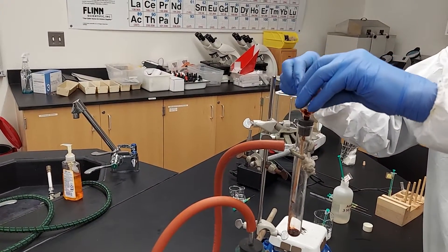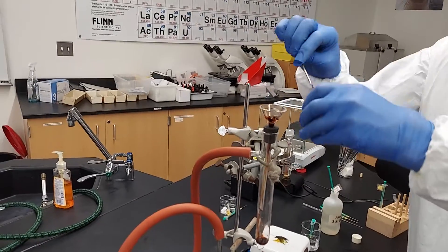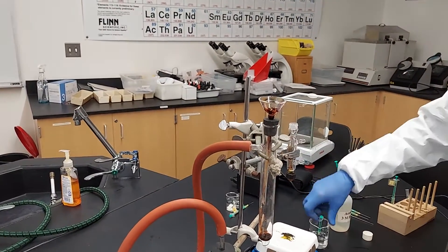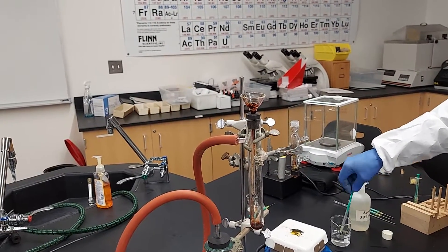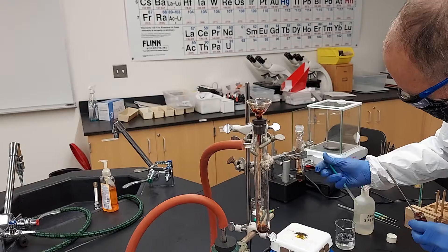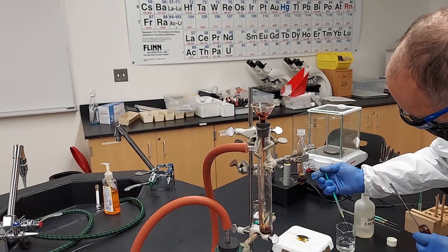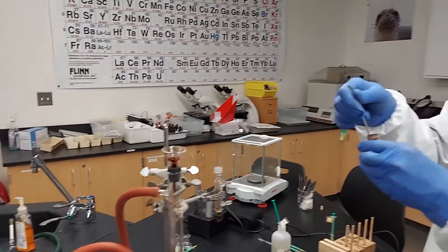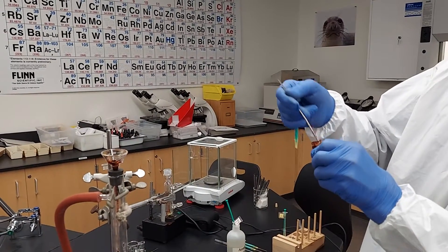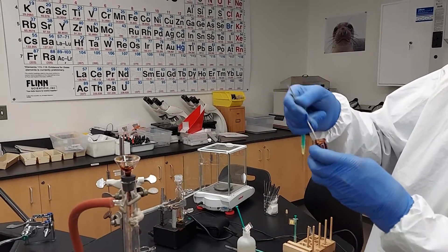We're supposed to do three rinses. First rinse with one half milliliter of water — that's 500 microliters of water — always rinsing into our original flask first. Got to get as many crystals out of there as we can.